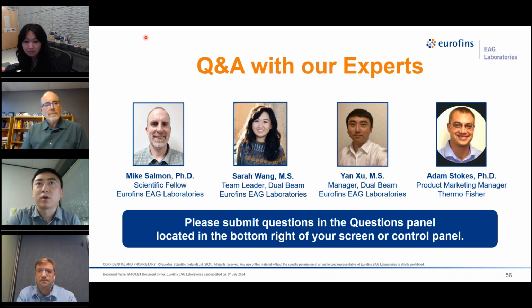So first, I have a question for Sarah. Can we use PFIB for anodizing structure analysis?